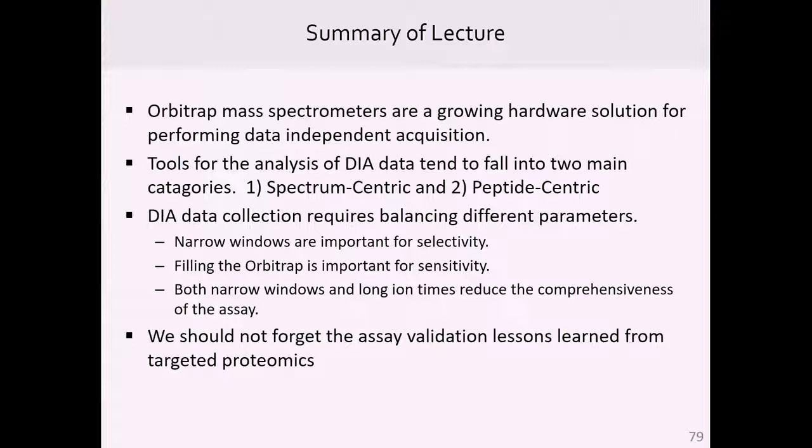We'll talk a little bit more on Thursday about this experiment we did and published in 2013, where we multiplexed multiple different fills in the Orbitrap, and it really helps for selectivity, but it really killed us as far as sensitivity goes. We now feel like with the Lumos and the QE HFX, which is a brand new Q-Exactive instrument that's just released, you basically can get by with 15 to 20 millisecond fill times in some cases.